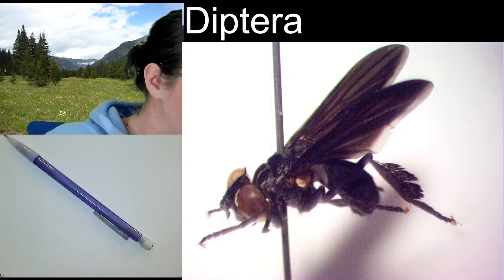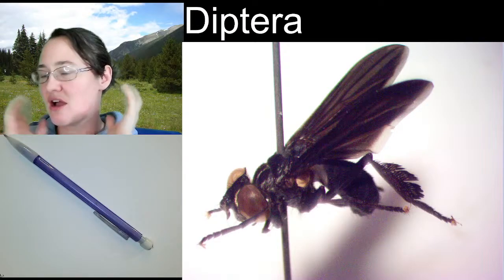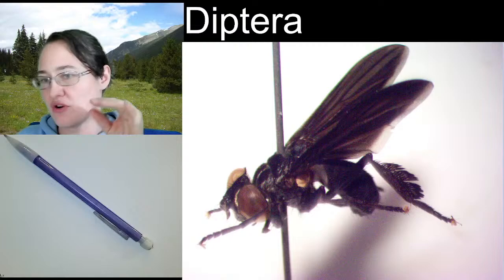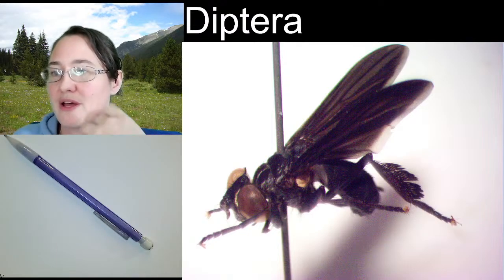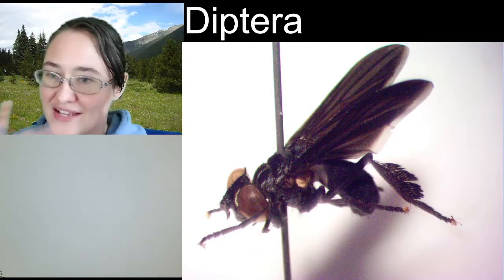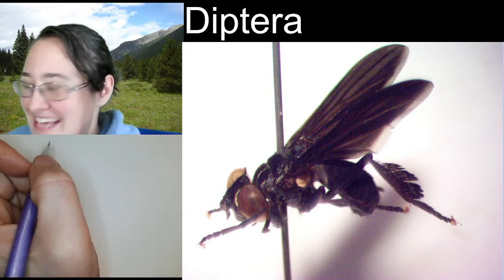This fly, so when you pin flies, flies' heads are kind of on a stalk from the thorax. And so they can move a whole bunch. The fly heads tend to kind of turn on you while you pin them, or at least they turn on me while I pin them. And so the fly's head is just a little bit crooked. We're going to straighten it out in our drawing.